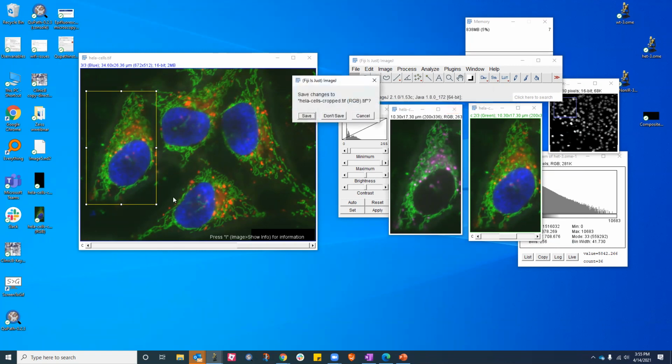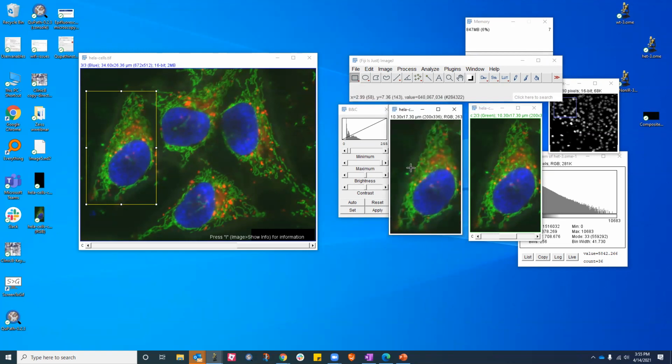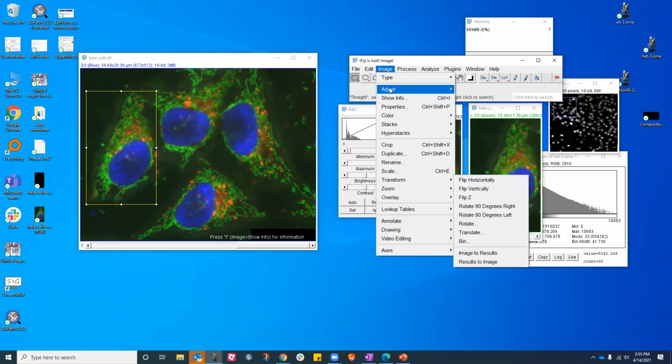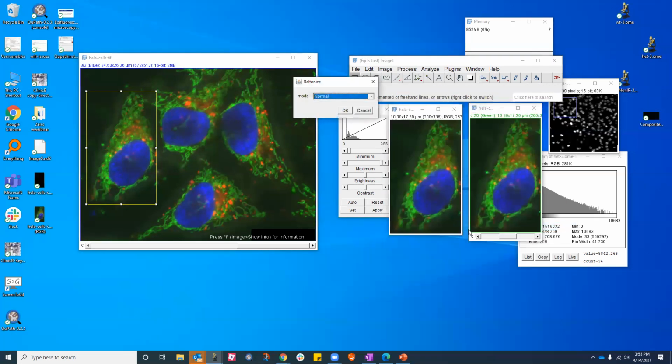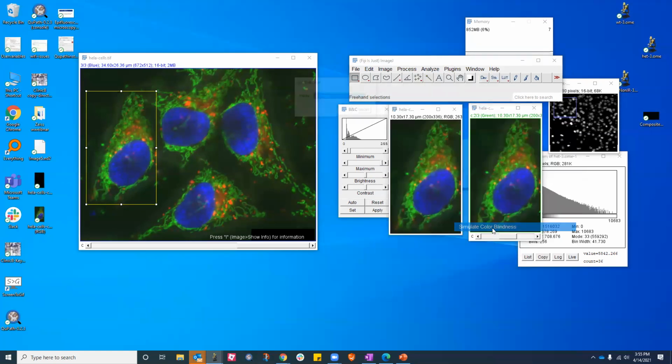One of the other things it really mentioned over here is how would a colorblind person see this, right? I mean, you and I are fine, we can see this, but what about somebody who is colorblind? Okay, so simulate color blindness. There are a bunch of modes. Let's just do normal mode. So different people have different issues.